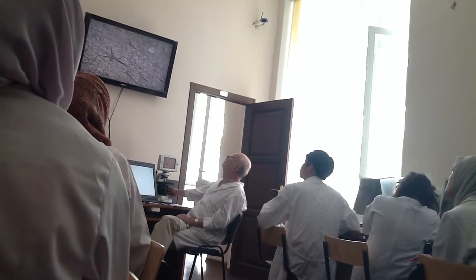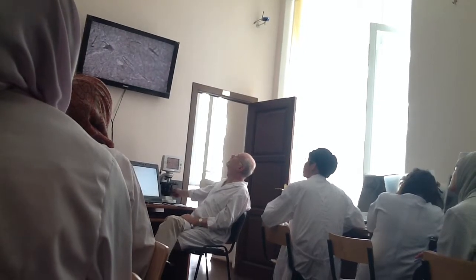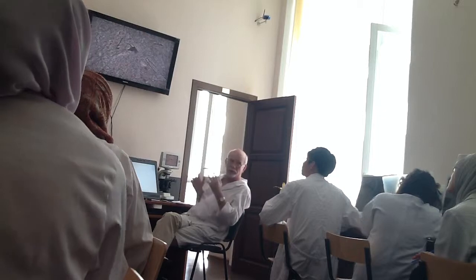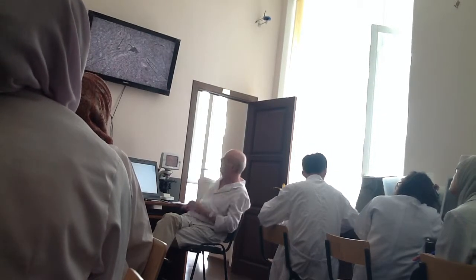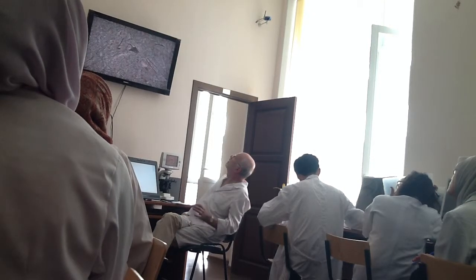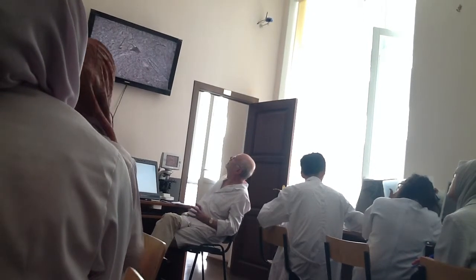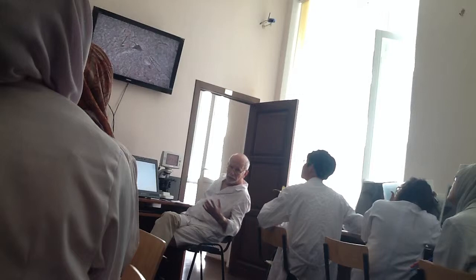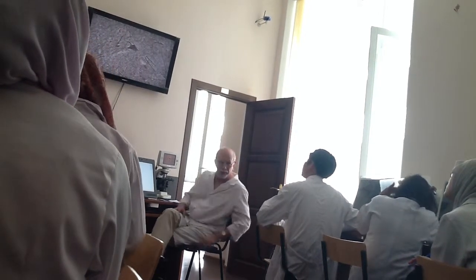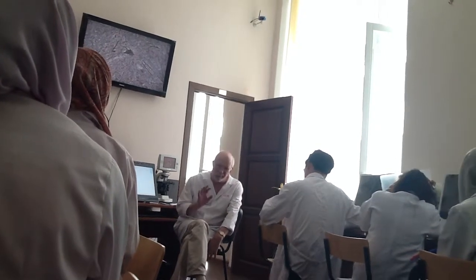This one. Oh, see you, it's ganglionic. So above the ganglionic layer, in this region, there are a few cells that form the inner granule layer. But in this section, in this slide, the granular layers are poorly developed.